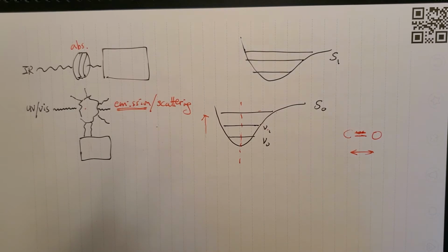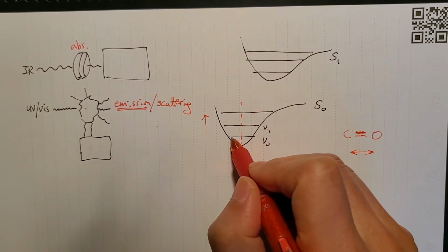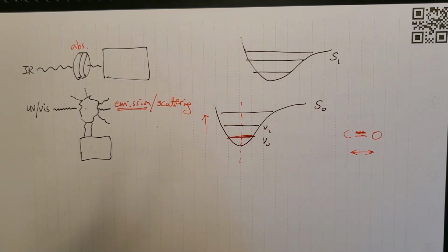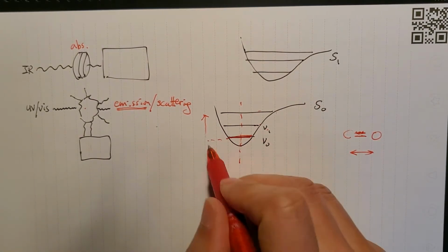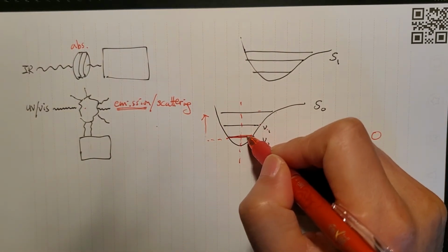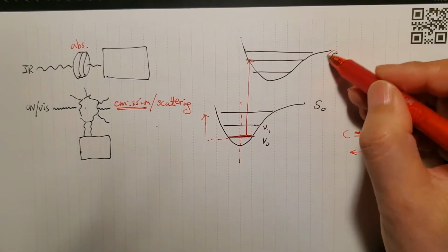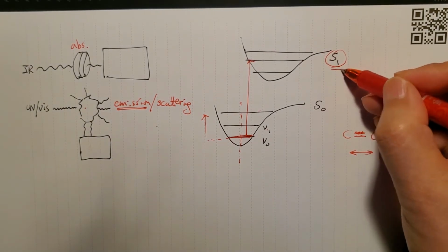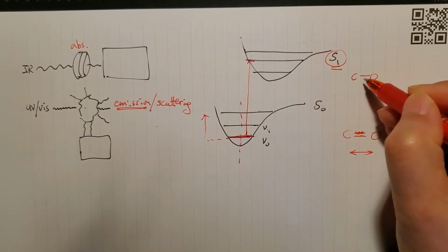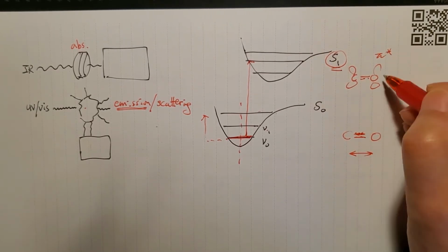So when you give light to do a measurement with the Raman machine, the majority of the molecules in the sample that are here in this vibration state with this much potential energy, whatever the number is, get excited. But we are not exciting to the electronic excited states up here, like the first electronic excited state, meaning you break this bond partially and bring one of the electrons into the pi star orbital here, right?